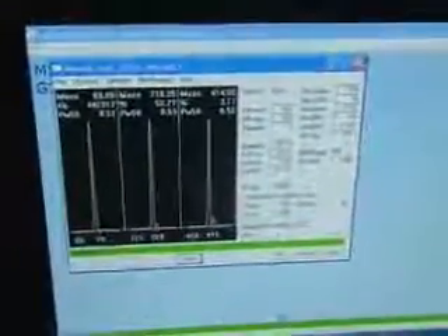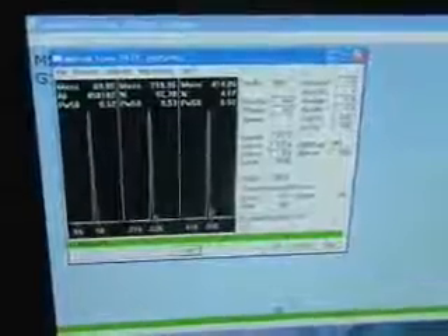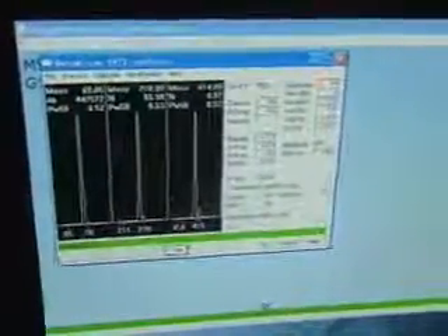It's running XP software, the version of Chemstation. You can see right now where it's in the manual tuning scan — we ran a sample of VFTPP. The instrument is in excellent condition and can be shipped out with minimal use.